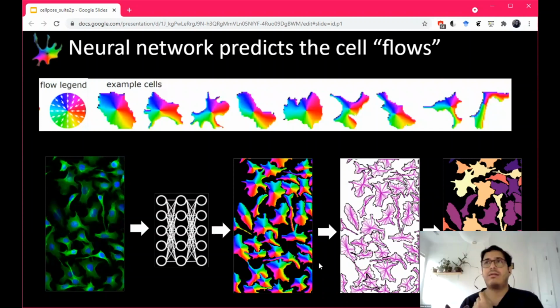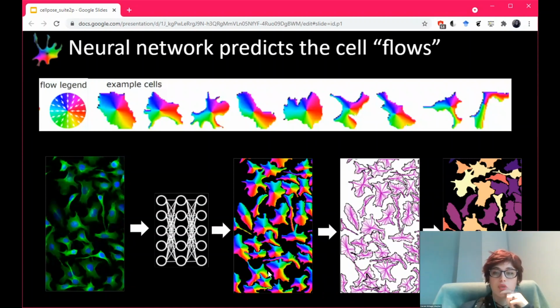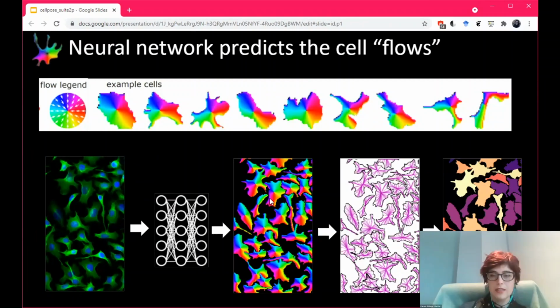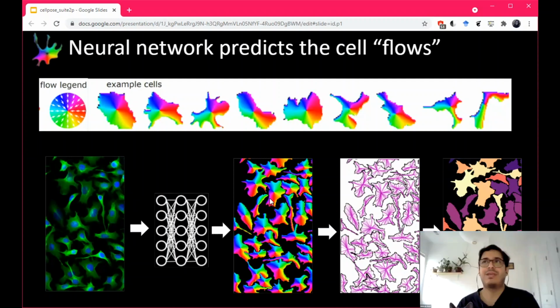So then the piece that's on the other side of an overlap is assigned to a separate cell? In this case, we try to get rid of those as much as possible, but the ground truth for this data set, we actually curated because they had done that sort of thing where they had allowed them to be separate. But in principle, we can't learn across that boundary. Sorry, you throw it away. Okay, yeah. I think in some cases we kept some of those, and then it's errors that our algorithm makes and also the other algorithms make. Sure. Other than that, in most cases, the piece that's thrown away is probably tiny, so it's fine.